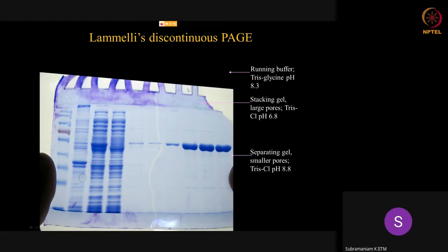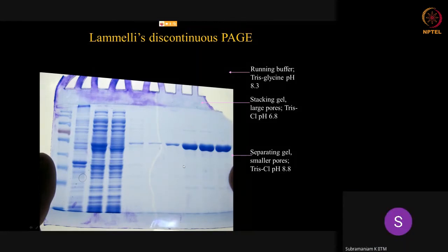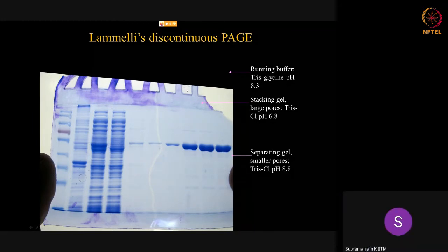Now when the protein solution migrates, it will be a 1 centimeter column that is migrating. So a given molecular weight protein is present all through this 1 centimeter column. So every band will be exactly the same height as the original column of liquid that was there. So due to that, you are not going to get fine sharp bands like this. Look at that. This well was filled, but this protein is only a sharp band.